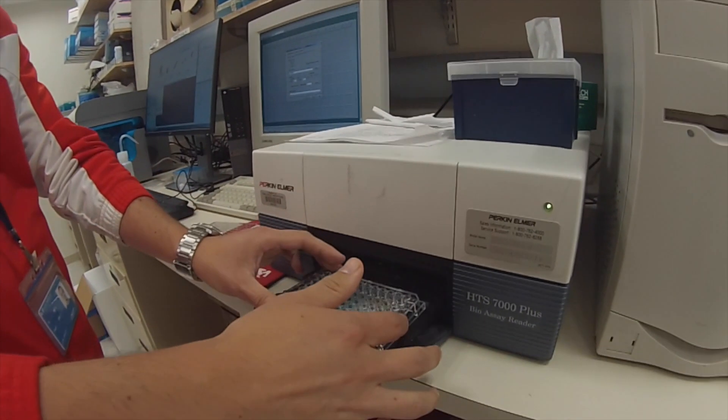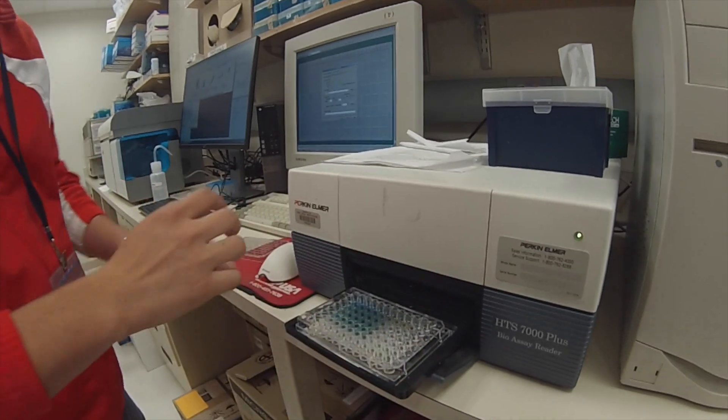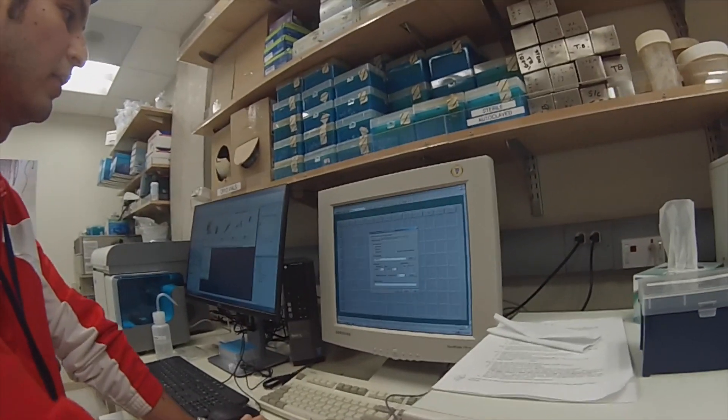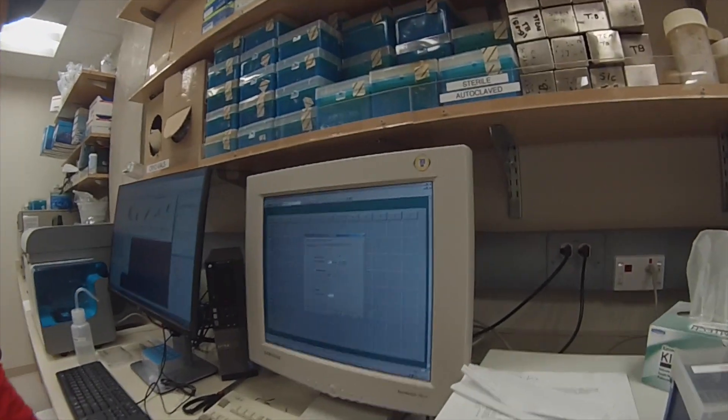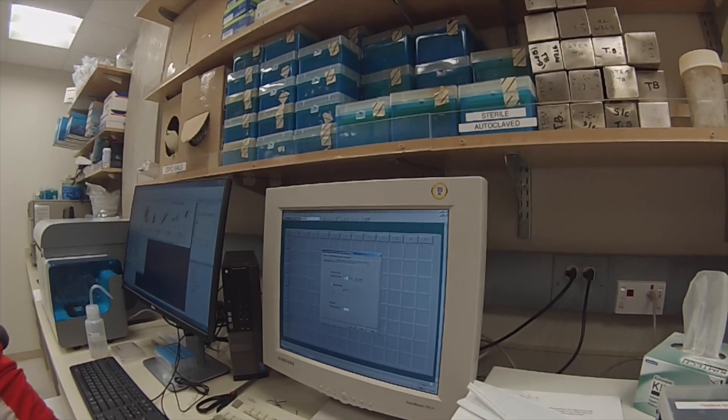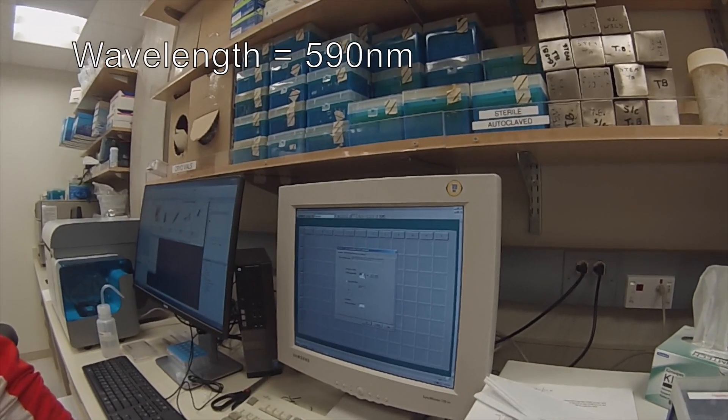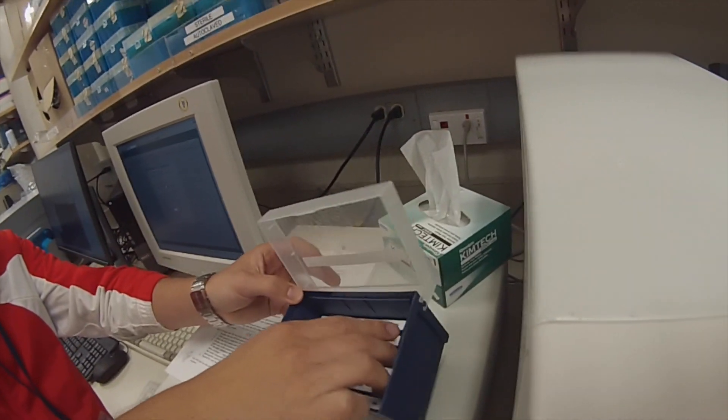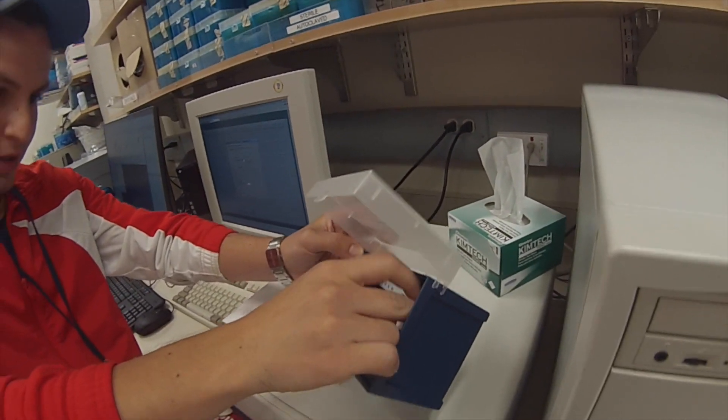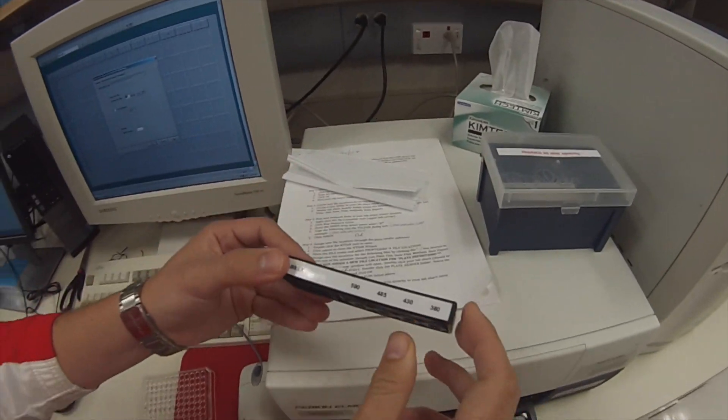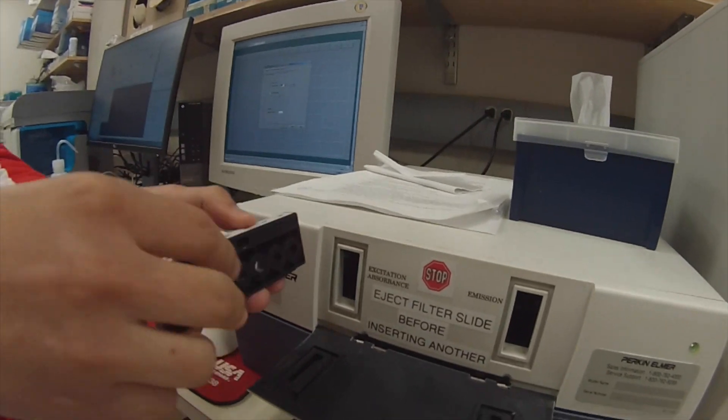We also have to set the wavelength of the absorbance filter because that's the measurement filter that we're using. Normally we use 590, well I'm using 590. It depends on the experiment that you're doing. We have these filters and we're just going to put them in here.